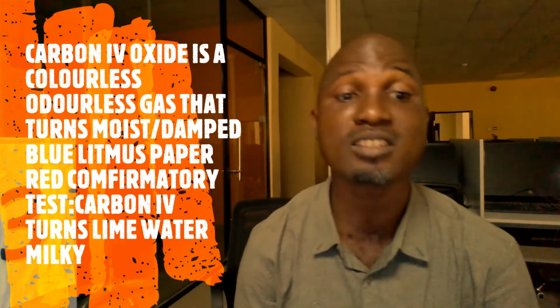To now confirm that this is carbon 4 oxide, when you bubble it through lime water. Yes, what is lime water? Now here, are you asking already? Lime water is aqueous calcium hydroxide. When you pass carbon 4 oxide through lime water, it turns lime water milky.